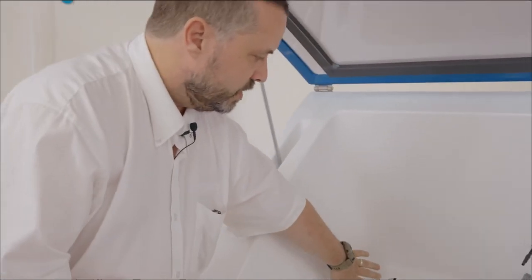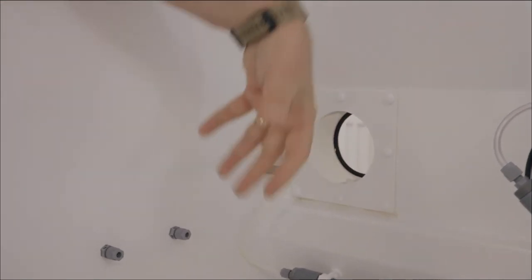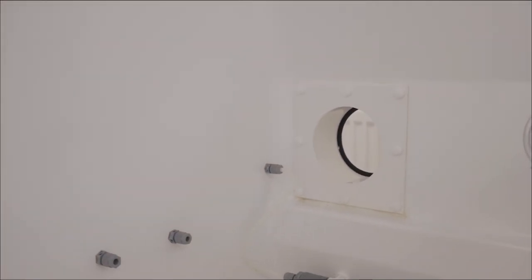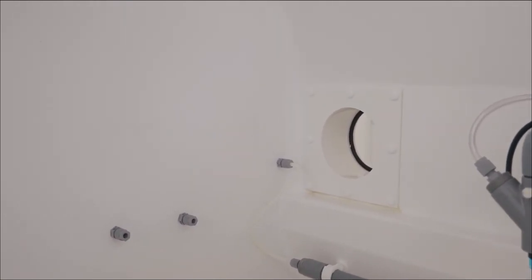To the left we can see we have an exhaust port. This allows the conditions to escape from the chamber when testing is completed or to allow the air to pass through the chamber when we're in controlled humidity modes.